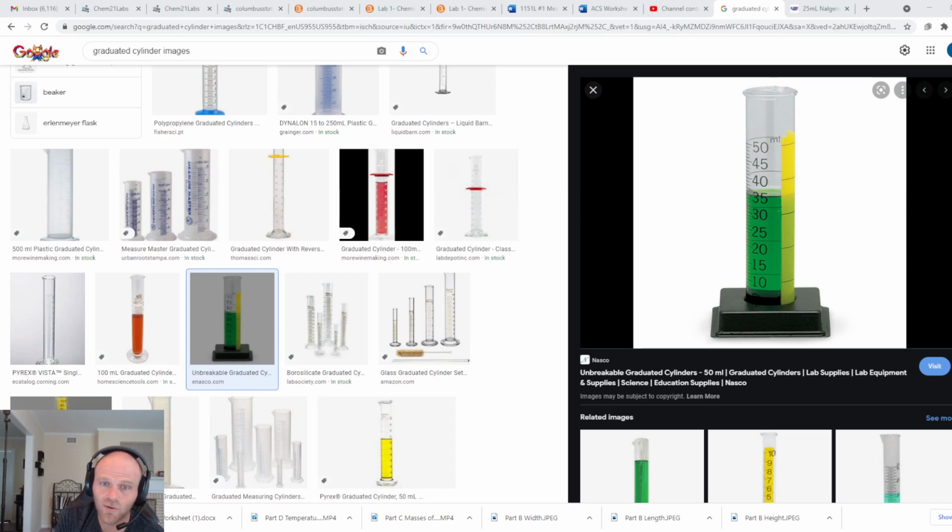Right? I can always get a device that measures more accurately and has more precision, and then that device would tell me it's actually 35.056 milliliters in this cylinder, as opposed to the one that I'm using, which I can only tell if it has 35 or 36. Okay? So, anyway, that's the estimated digit.